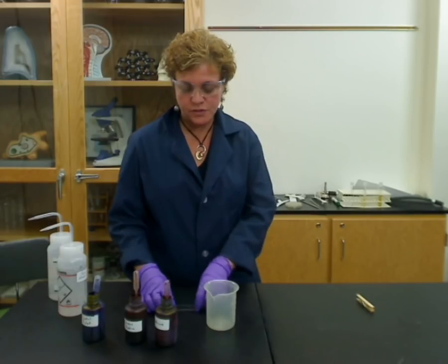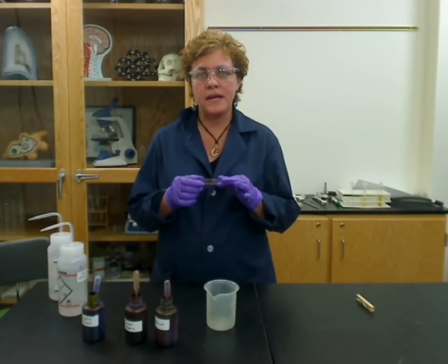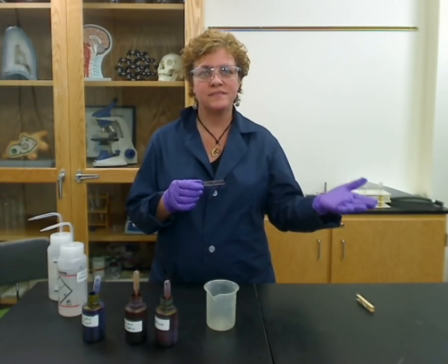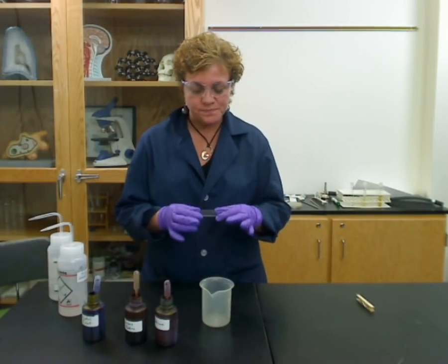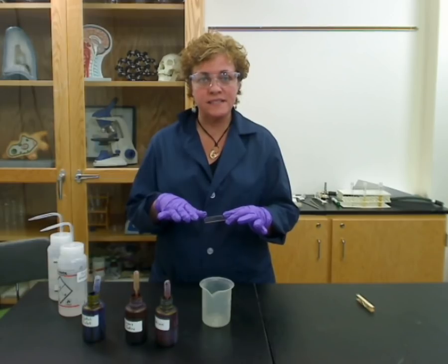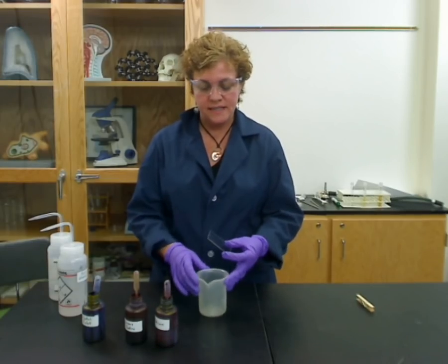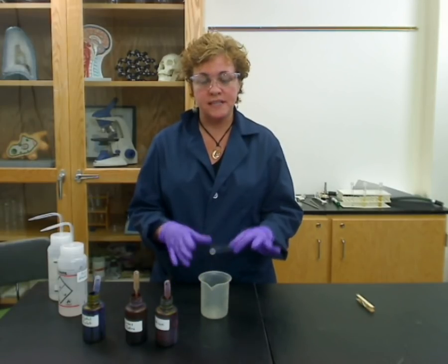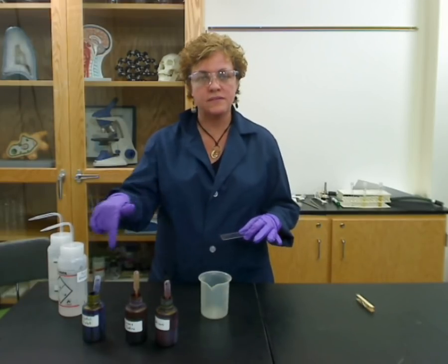The first thing we're going to do is start with a bacterial smear that was already prepared in our bacterial smear video. It's already been heat fixed so it's not going to move off the slide, and now you just want to stain it. Usually you'll have a sink nearby, but if you don't have a sink you can do it right on the table with a few squirt bottles and stains.